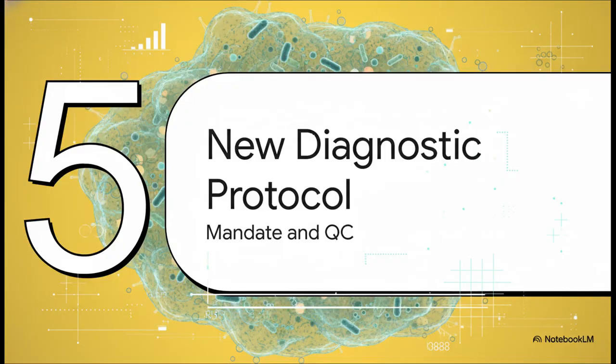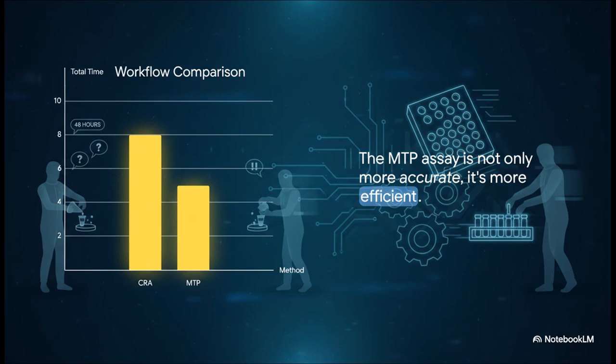So let's wrap this up by outlining the new protocol. This is the new standard of practice for this lab. Pay close attention because this is what you'll be expected to follow. Now, for anyone thinking this new assay sounds like more work, you'd be wrong. A 96-well plate might look intimidating, but when you factor in everything, media prep, streaking, incubation, and then standing around debating the color of a colony, the total hands-on time for the MTP assay is actually less. It's not just more accurate, it's more efficient.